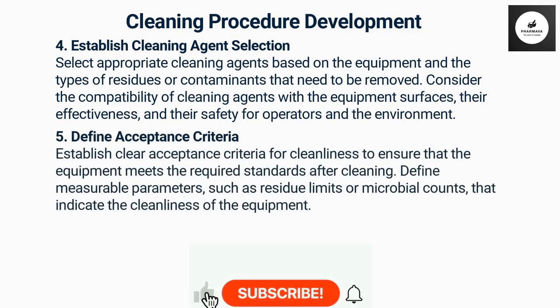Define acceptance criteria. Establish clear acceptance criteria for cleanliness to ensure that the equipment meets the required standards after cleaning. Define measurable parameters, such as residue limits or microbial counts, that indicate the cleanliness of the equipment.